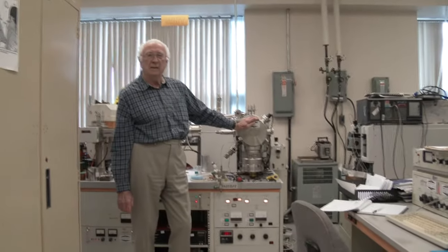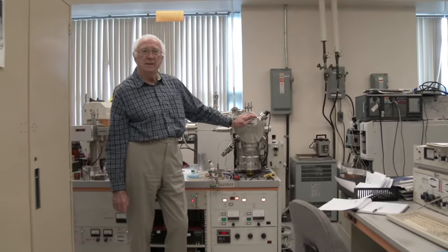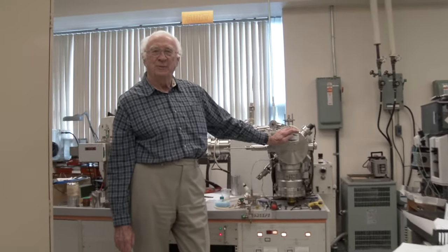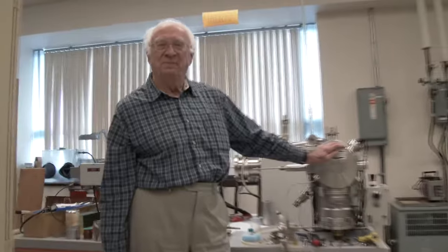This is John Holmes, who opened the first mass spec facility in the spring of 1964 when the Department of Chemistry was awarded a grant for $56,000 by the NRC, the Research Grant Giving Agency of Canada at that time.